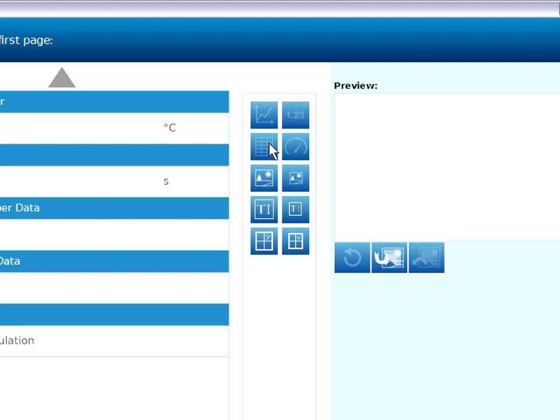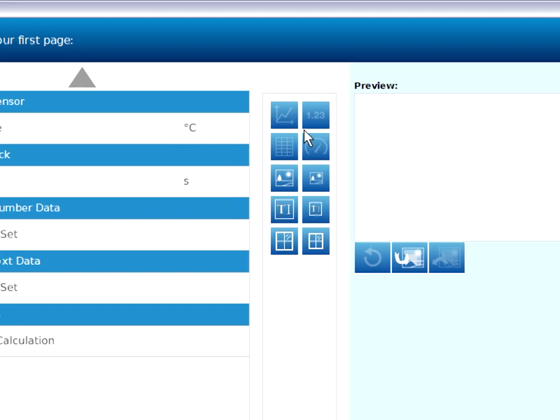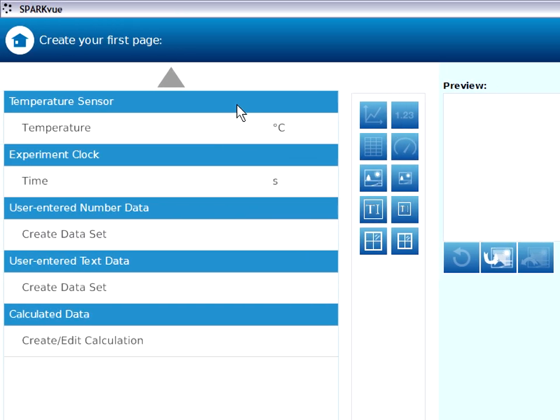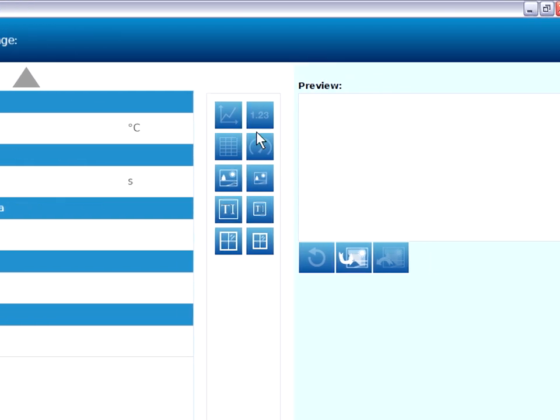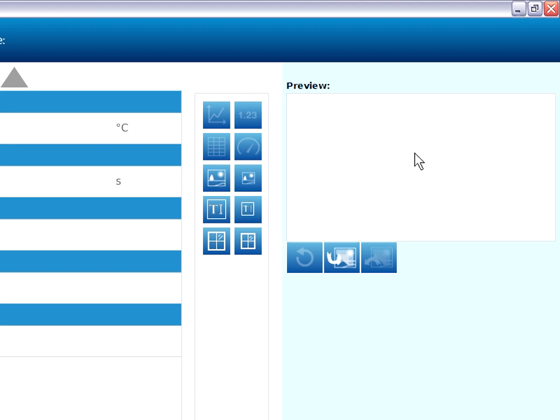You'll notice that the data displays in the top are all grayed out. That's because we'd first need to use this column on the left of measurements to identify what measurement we'd like to see in the data display before we use it. Finally, on the right third of the page, we see a preview window. This page is going to fill with the page elements as we construct the page.